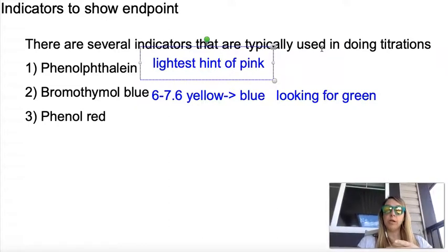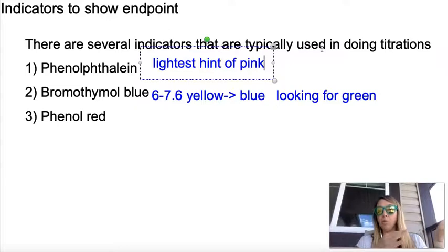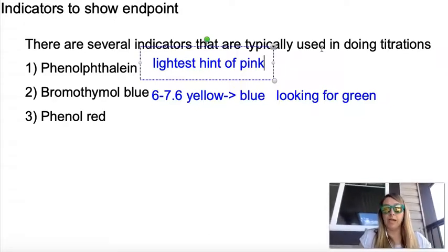Okay, and again, this is really hard to explain without actually being able to show you. But generally what you want to do is open the valve a little bit, just so that a little bubble starts to form on the end of your burette. Then you pick your Erlenmeyer flask up and you basically tap it on the side inside your Erlenmeyer flask, and that will transfer that partial drop into your flask. And then very carefully, you would take your Erlenmeyer flask and tilt it on the side and try to incorporate it inside of there. Again, very much a skill, takes a lot of practice.